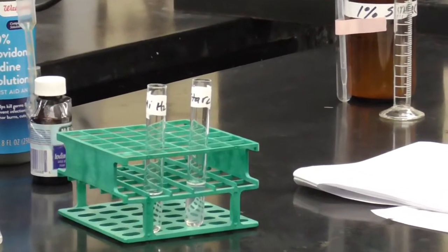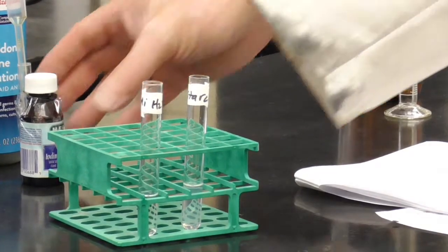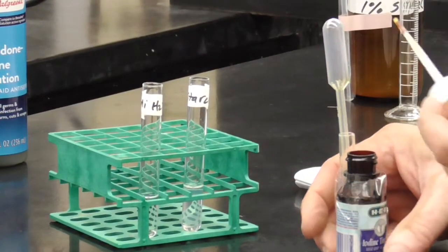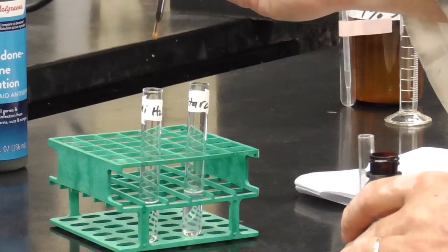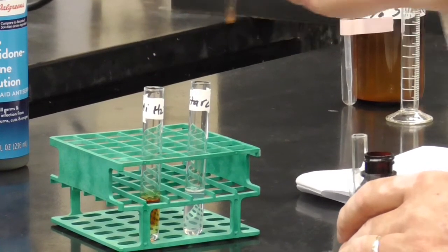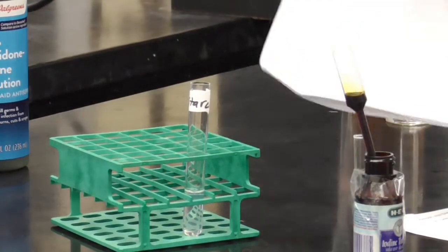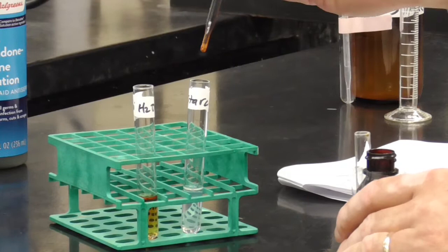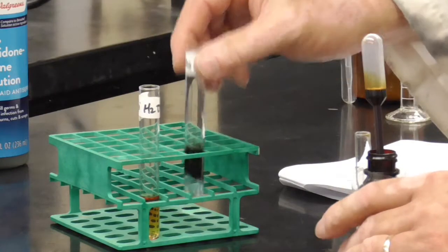Okay, so we got 3 in each one now. Next it says add 2 to 3 drops of iodine. So iodine actually reacts with the starch to give us our positive results. So let's see what that is going to look like. We'll go ahead and add 3 drops first to the negative. So iodine just in water. 1, 2, 3. Looks like that. I can stir it up a little bit, and with a white background you can see that it turns now a yellow goldish color. 3 drops of the one that has starch. 1, 2, 3. Mix that up.